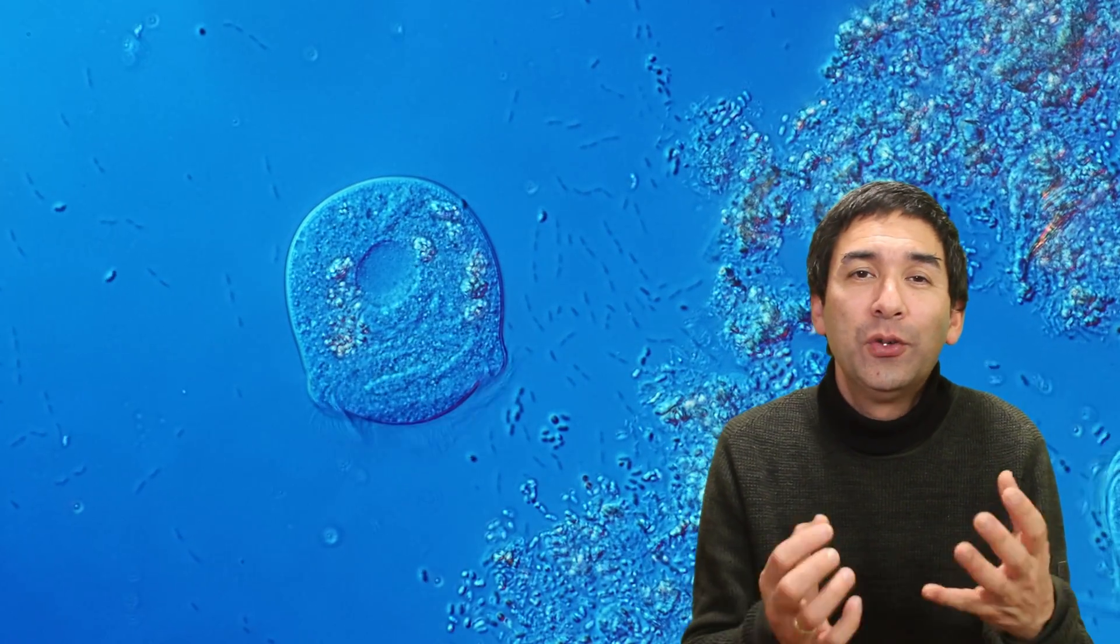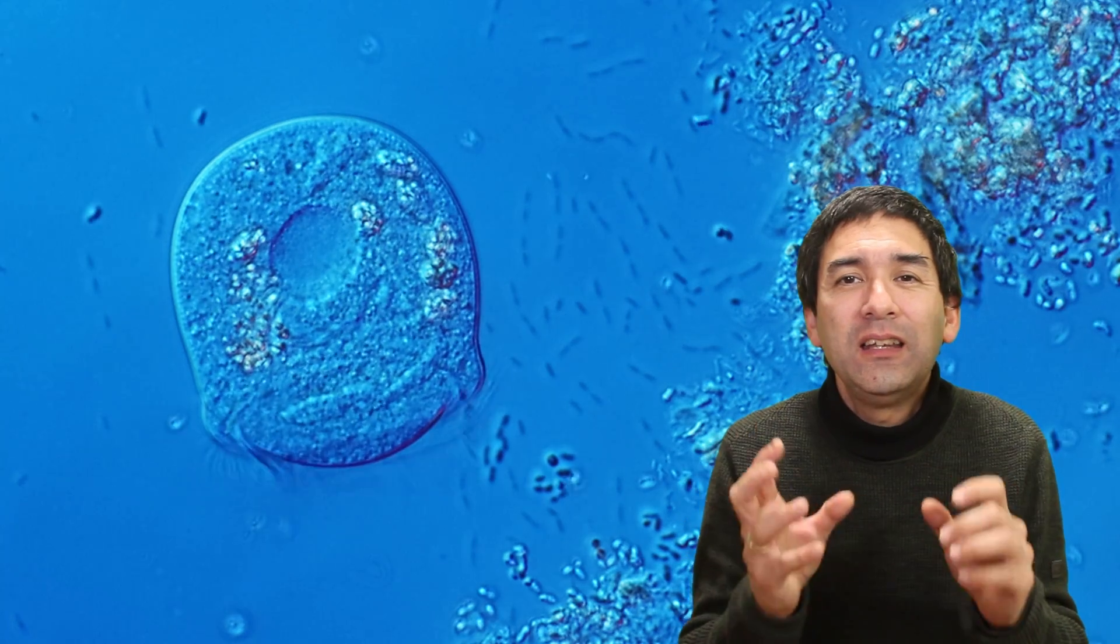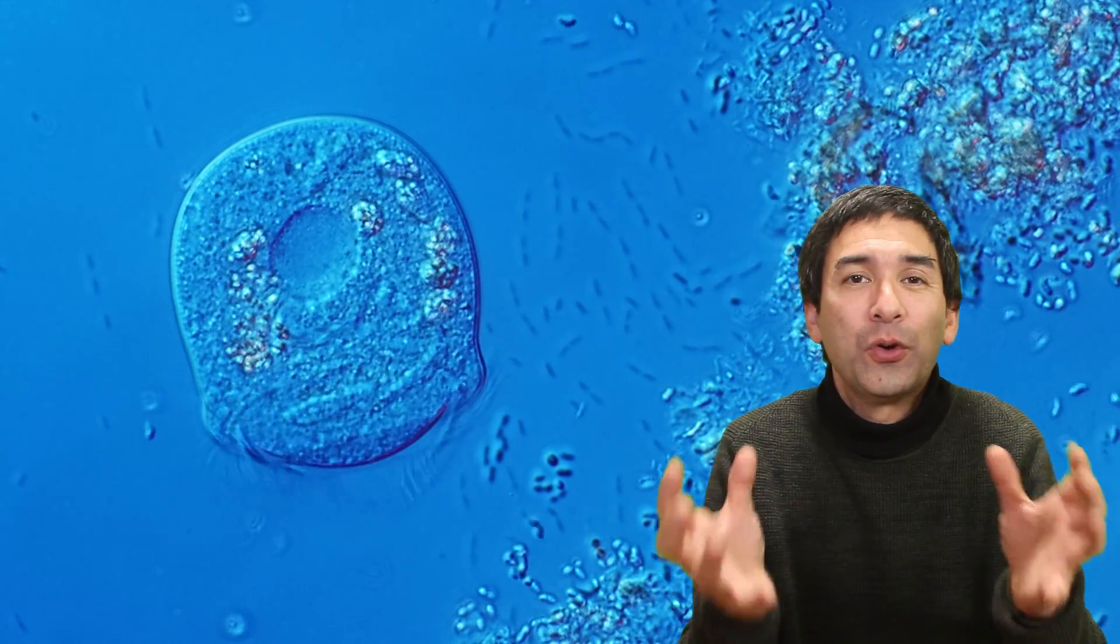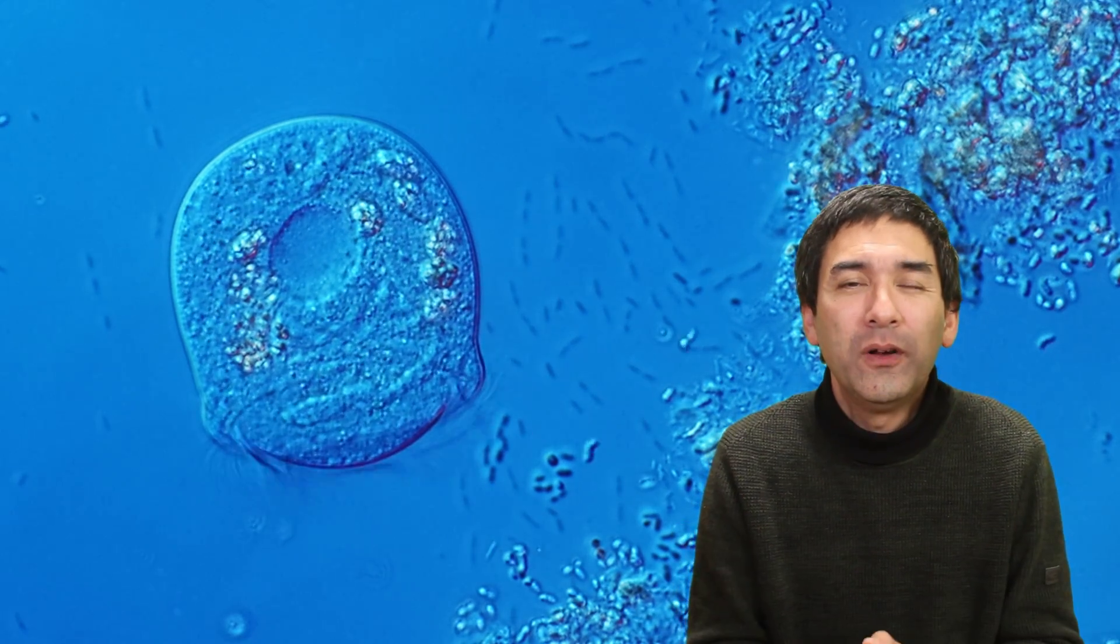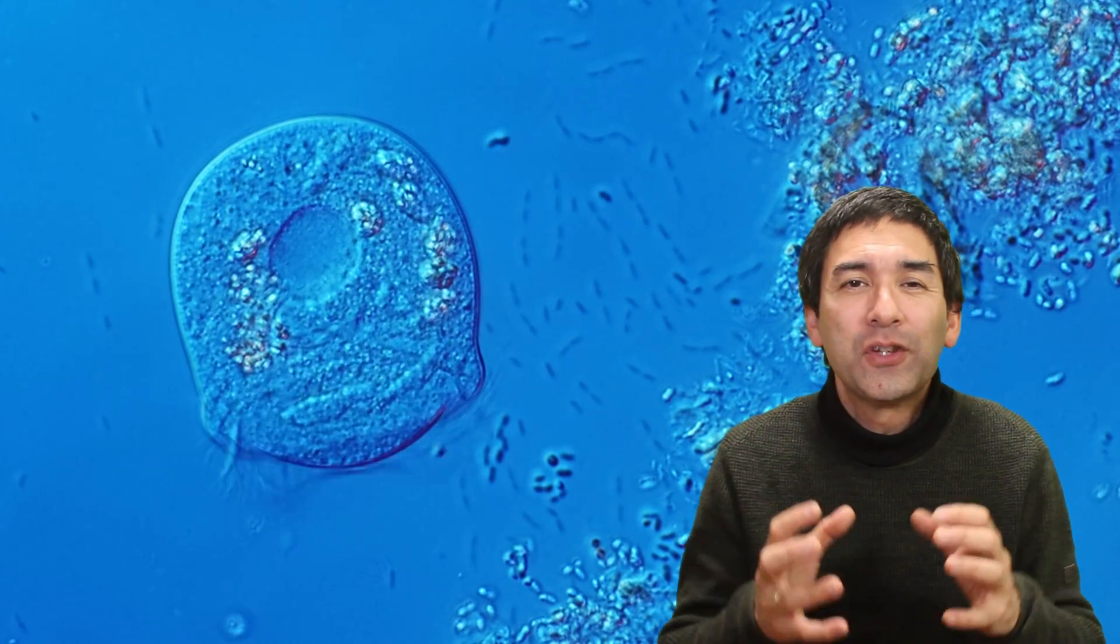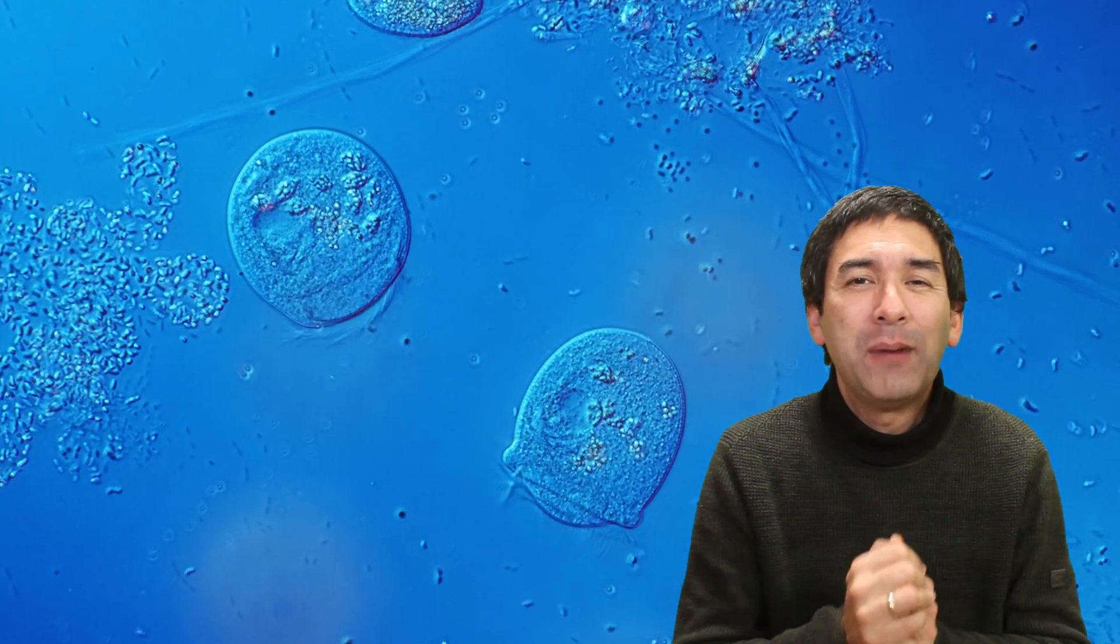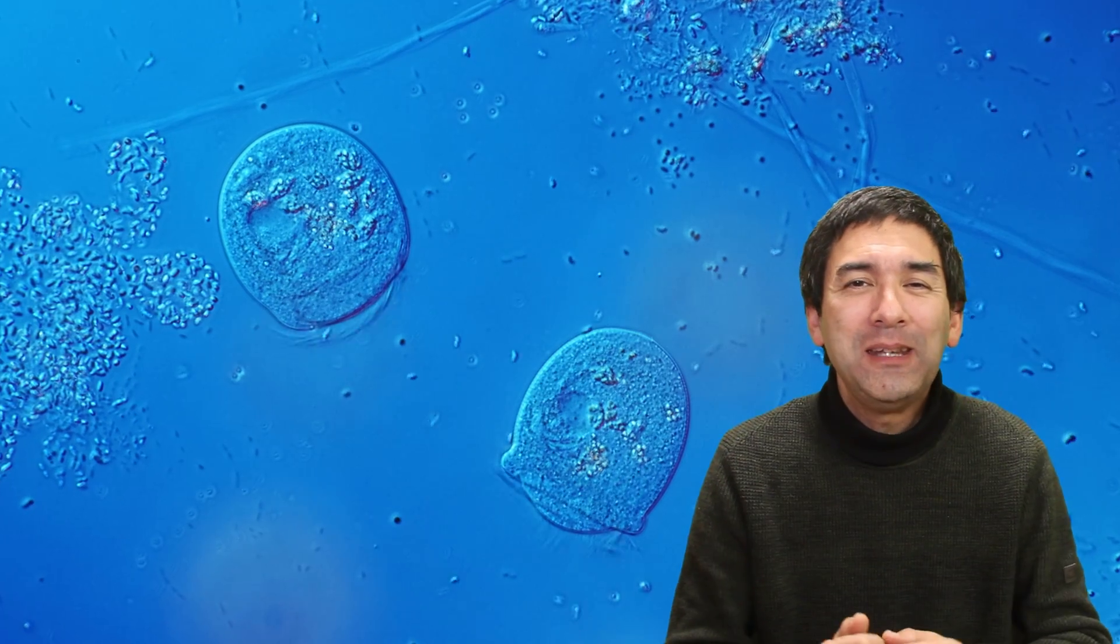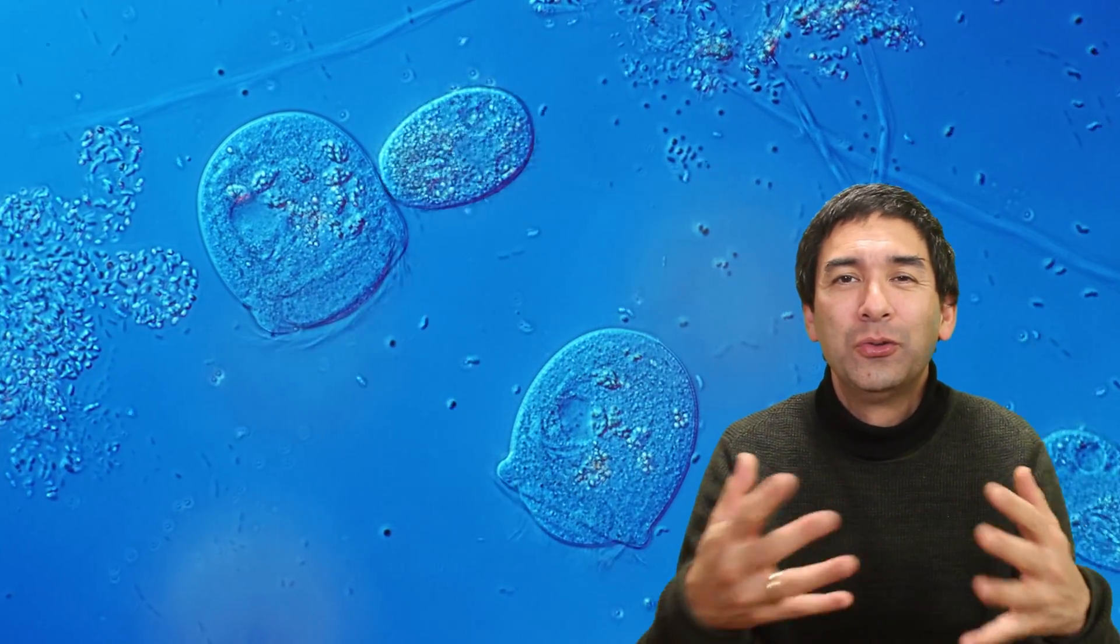And these daughter cells are free swimming cells and they're called swarmers. And those swarmers, which you're able to see here, they use their cilia to move through the water and capture food. The swarmers that you see here do not move. You might be able to see the cilia moving, but they themselves are not able to move forward because I compressed them between the cover glass and the microscope slide so that they're a little bit easier to see. Otherwise, they're quickly moving away and it's kind of difficult to trace them.